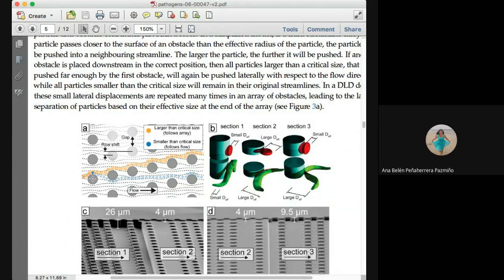It's easy to monitor and also get the separation. This is a microfluidic flow technique to separate from erythrocytes, and we can also follow this. These are the microstructures they use, and this is the size they use to separate the parasites from the red blood cells.